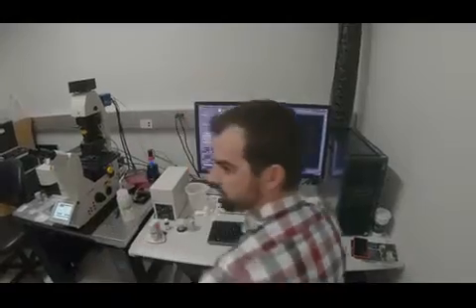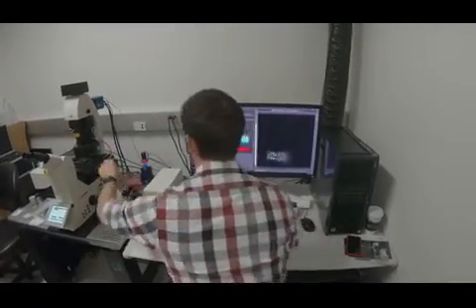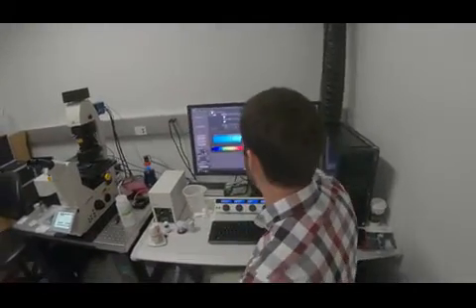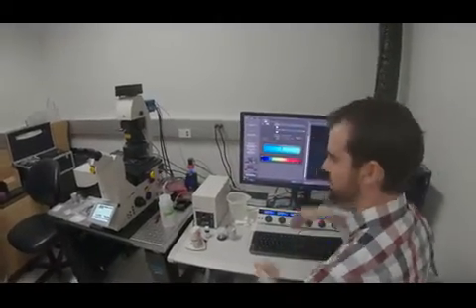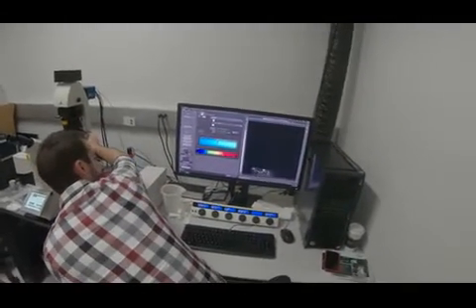It's really bad. It's super bad. It's really, really bad. It could be crazy off. You're really confused. That's why when you're setting up the illumination step, you see the two mirrors, you can fine tune, just make sure they visually are pointing at each other instead of off at a weird angle. That way it just makes this step a little bit easier.